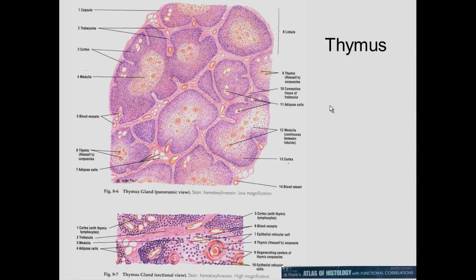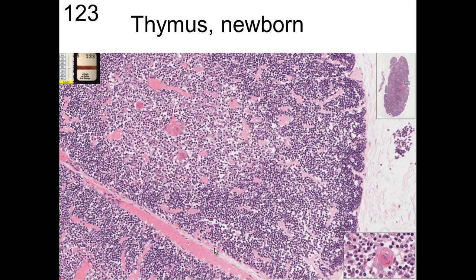One organ more prevalent in young individuals is the thymus. The thymus has different lobes, each with a cortex and a medulla. In the medulla you can see Hassall's corpuscles, which are concentric rings of material diagnostic for the thymus. In the thymus of a newborn we can see these different lobes, each with a cortex and a medulla.